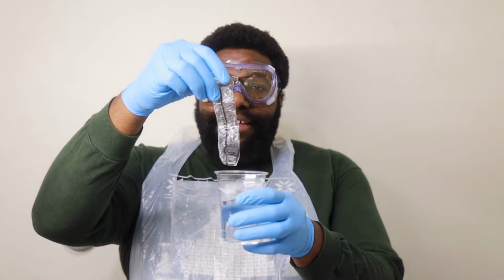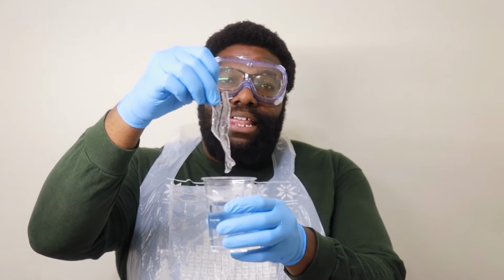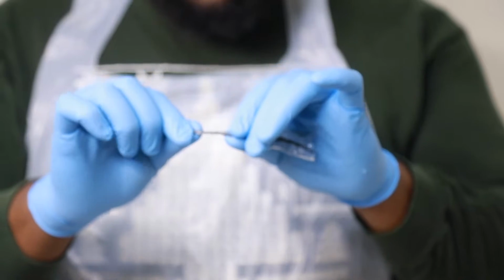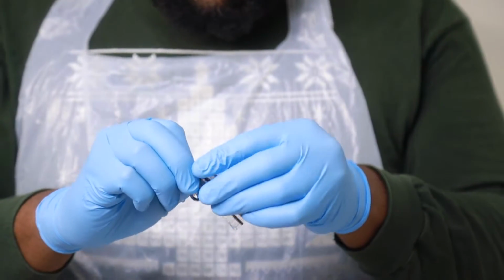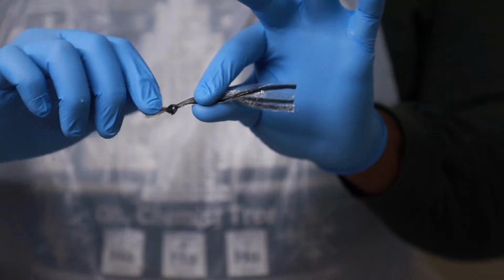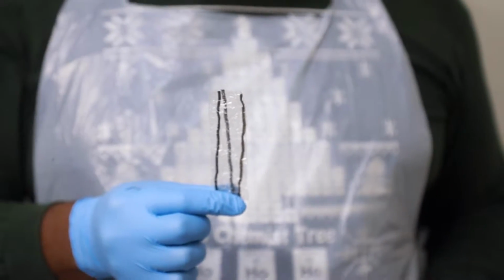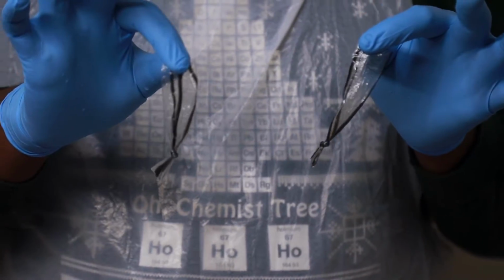I've cut the dialysis bag in half and soaked this part for about 3 minutes until it's malleable, so I can actually tie a knot with it. So I attempt to twist the end a little bit, and then you want to form a knot and pull really tight. You want it to be as tight as possible. Okay, now you have your cell membrane ready to go. With the extra dialysis tube, you can do another experiment. So we have 2 cell membranes. We can do 2 experiments.